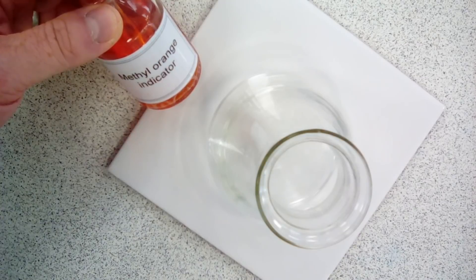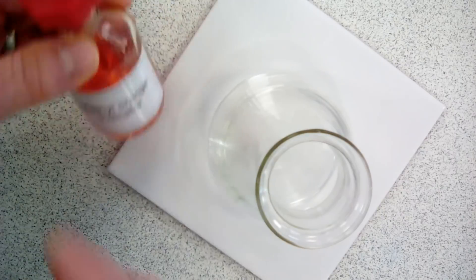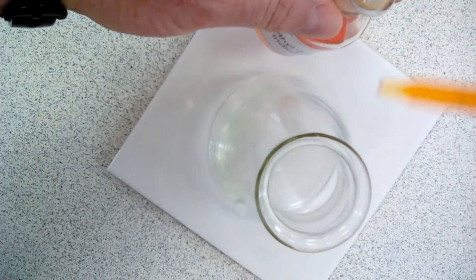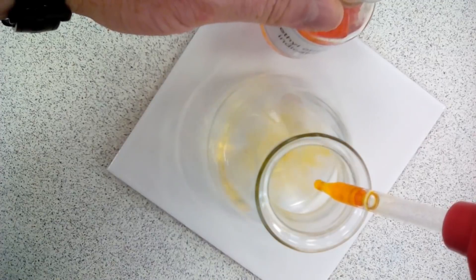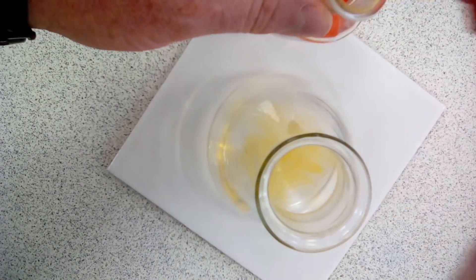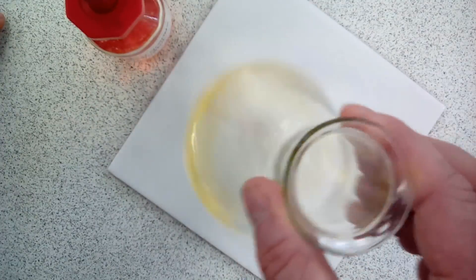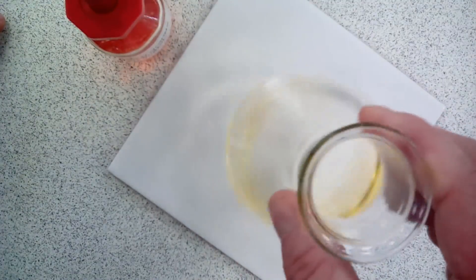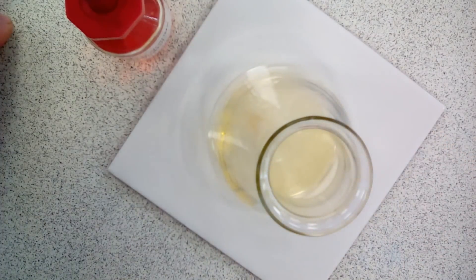We then put five to ten drops of methyl orange indicator into the 0.1 molar sodium hydroxide solution, and then we need to swirl the beaker to get the methyl orange to spread throughout the sodium hydroxide.